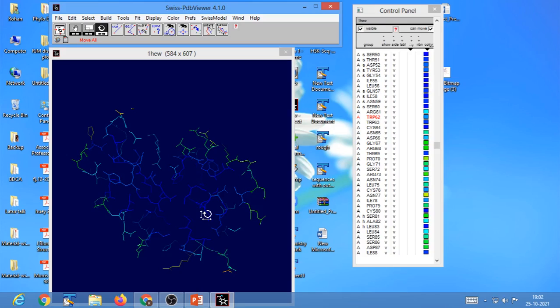With this display of the molecule in cross section, you can see that residues in the heart of the molecule are not accessible to solvent. By taking this slab, or you can say by taking the transverse section of your molecule, what you are looking at is the cut of your molecule. If you cut your molecule right from the center, this is what you would see.